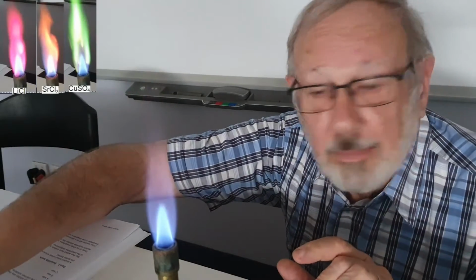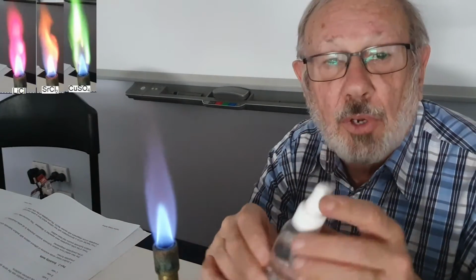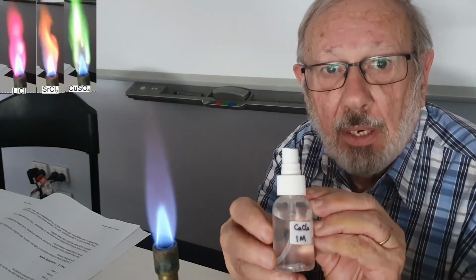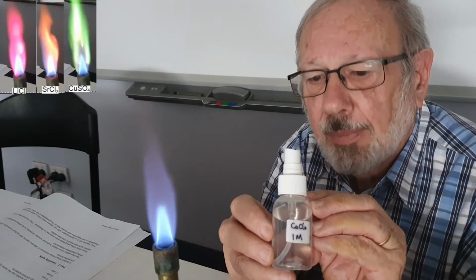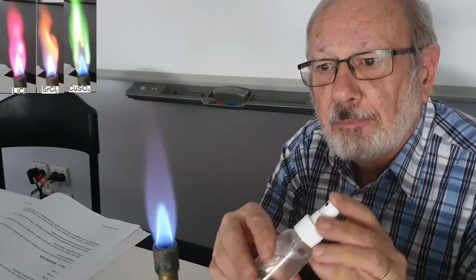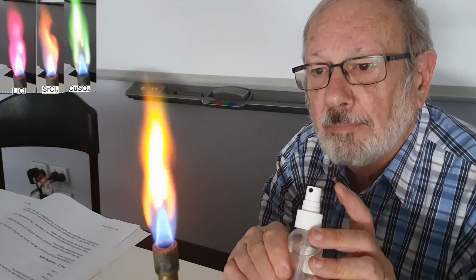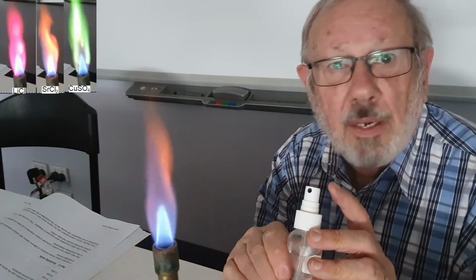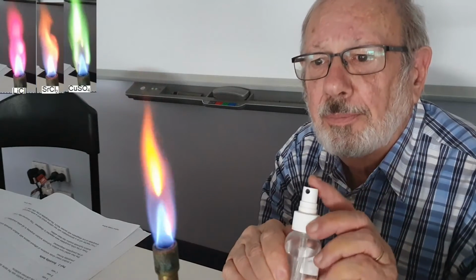Our next one is calcium chloride. Calcium chloride has the formula of CaCl2. Now that again, I would describe as bright orange.